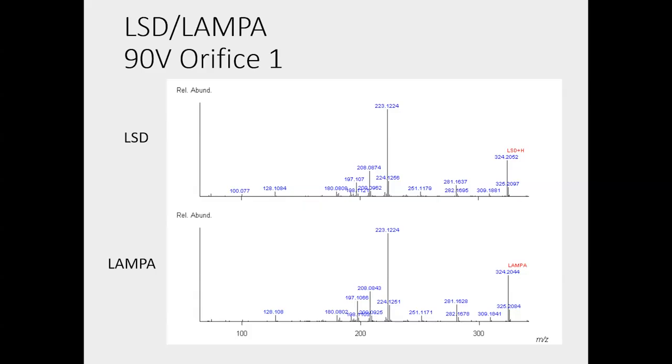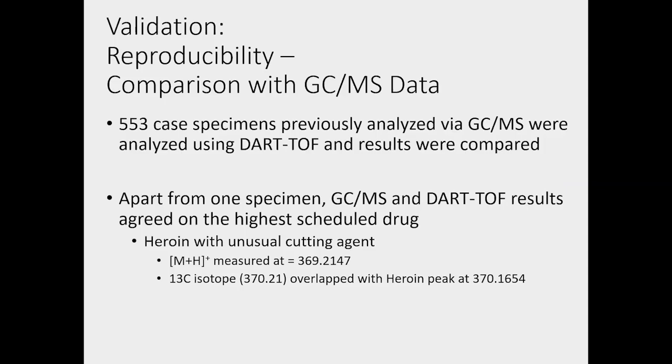So again, just further conclusion that this is a good screening technique, but maybe at least at this time not ready for confirmation. And then the third sort of study that they looked at was comparing the results with GCMS data, because of course, if we're trying to institute this as a screening technique, we want to make sure that it's actually giving us a valid idea of what is inside the sample.